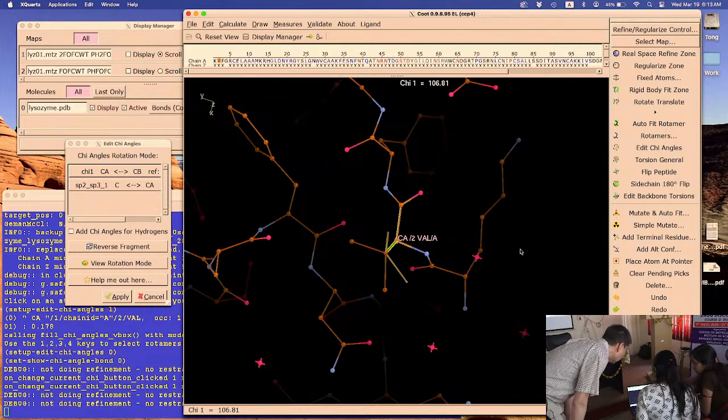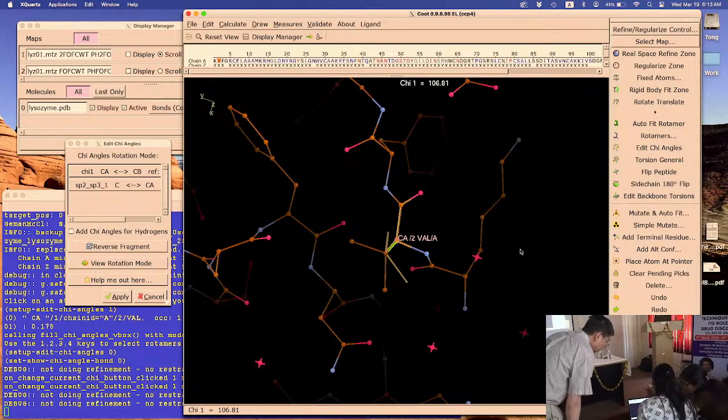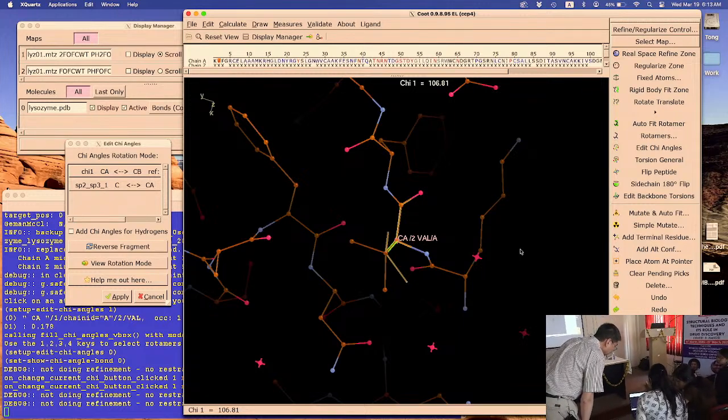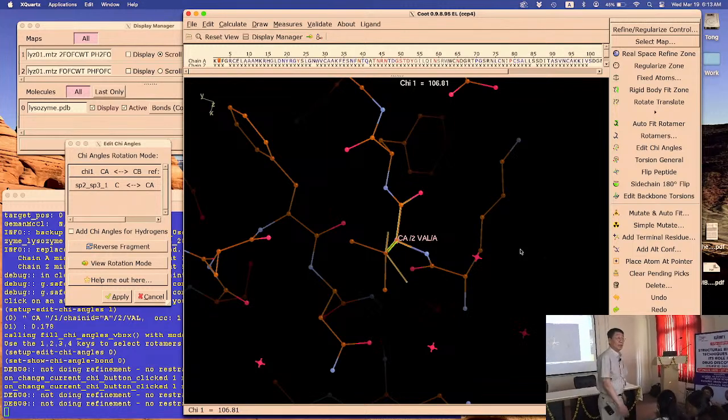So how to drag here? Drag the top. Yeah, there you go. It's the wrong button. Oh, there you go. So now you can drag with your left mouse. Yeah, drag. There you go. It's turning. Drag around more. There you go. Yeah, a mouse would be much better.